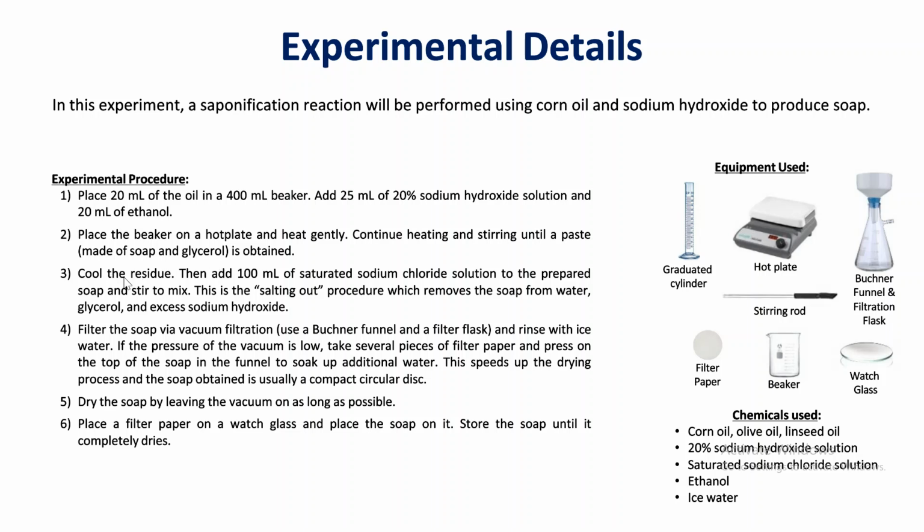You're going to cool the residue. Add 100 milliliter of saturated sodium chloride solution to the prepared soap and stir to mix. This is called the salting out procedure, which removes the soap from the water, glycerol, and excess sodium hydroxide.